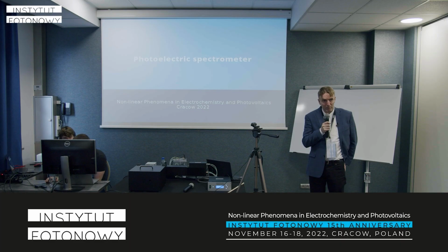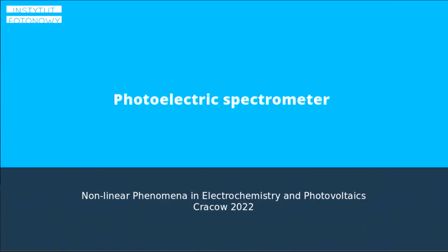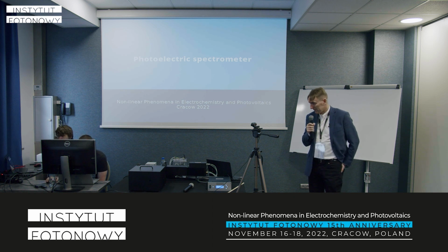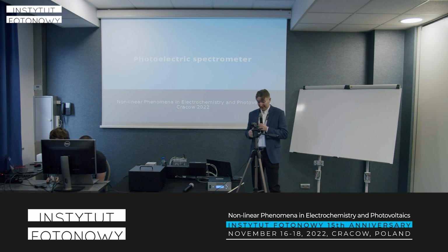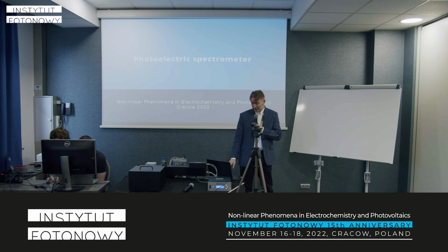In this session, we'll be talking about the capabilities of the photoelectric spectrometer, but in general about electrochemical measurements, because this instrument is designed mostly for electrochemical measurements, but it can also measure photovoltaic samples.